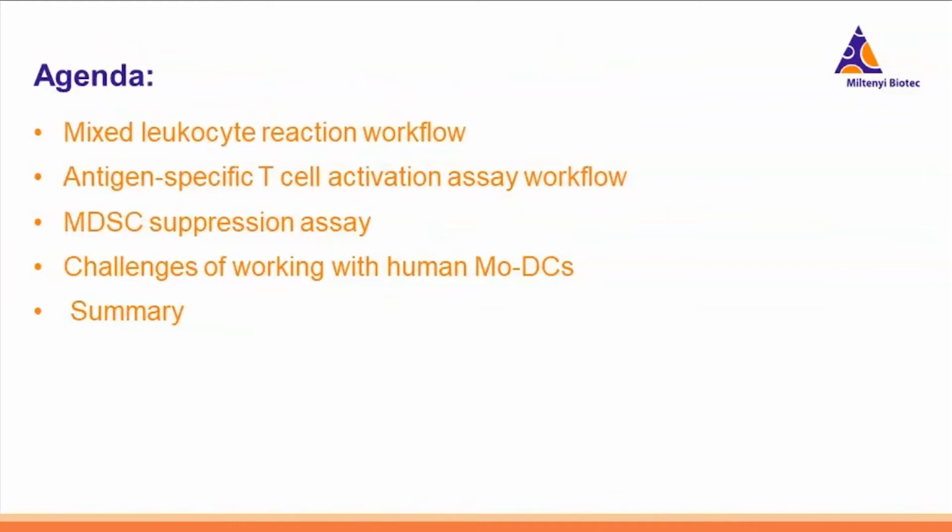I will also cover the antigen-specific T-cell activation assay and the associated workflow. I will give an overview about the MDSC suppression assay as one example of suppression assays. Moreover, I will present you common challenges that are related to this assay's workflow. And at the end, I will sum up my talk.